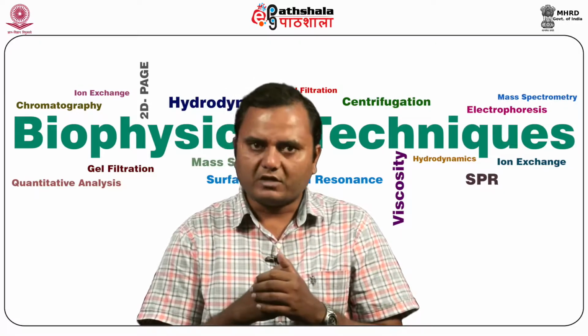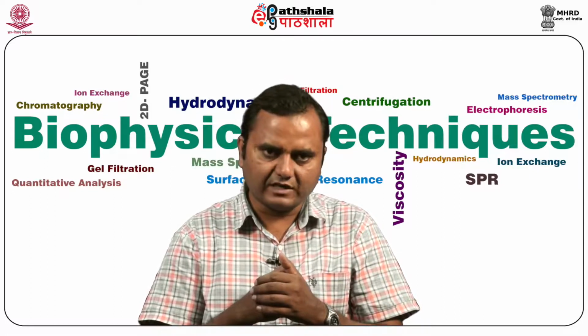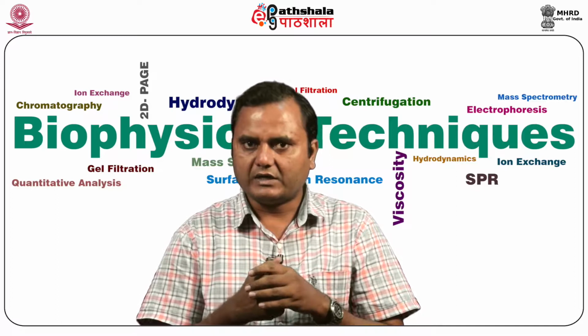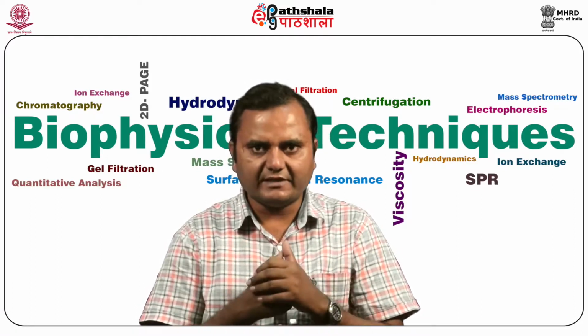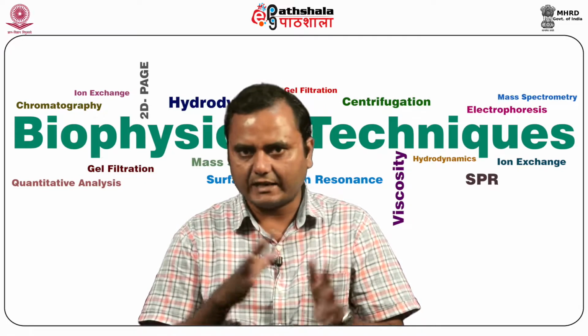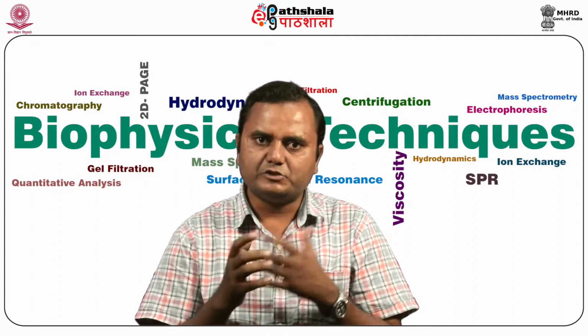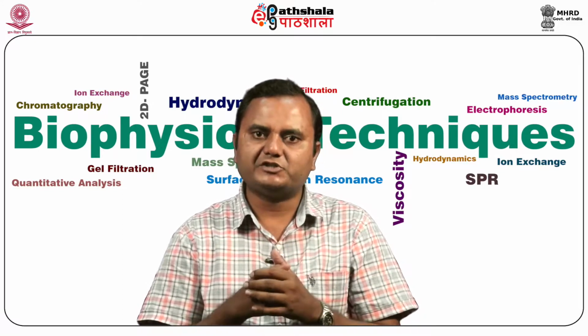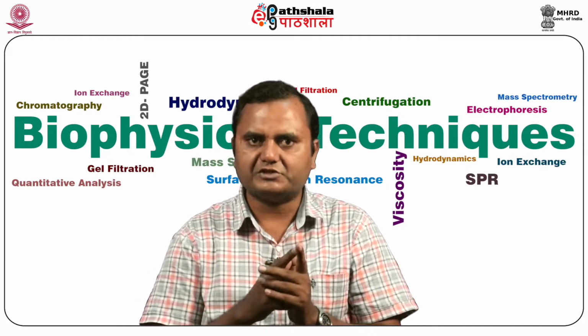So here we talk about the design of the optical system of the ultracentrifuge. If the ultracentrifuge is preparative, it doesn't have any optical system, but if it is analytical, then there should be an optical system which is used to take the actual, dynamic picture of the molecule during the centrifugation process.